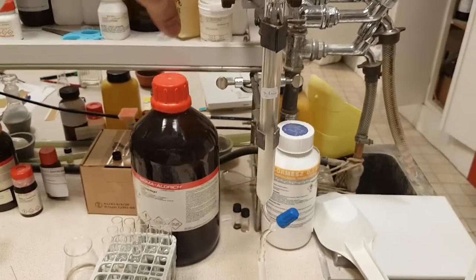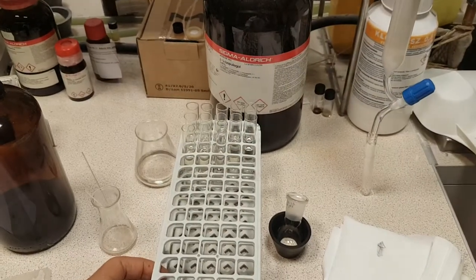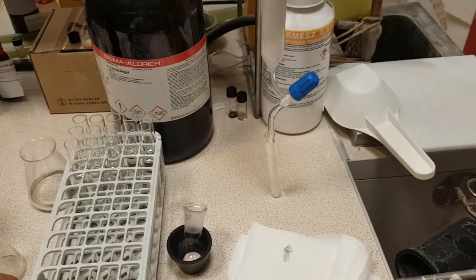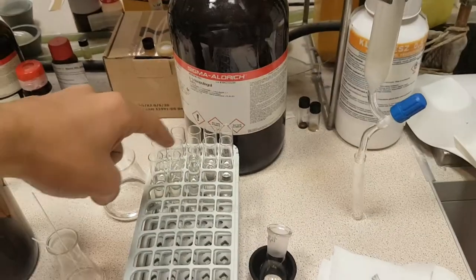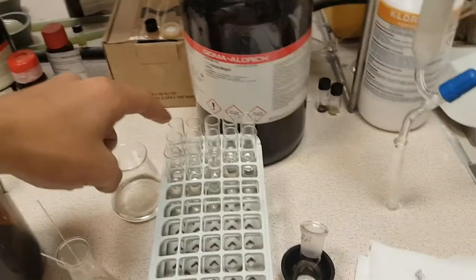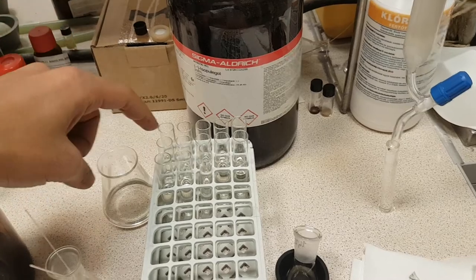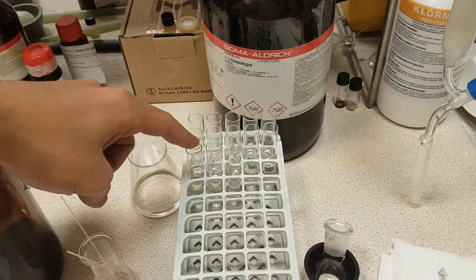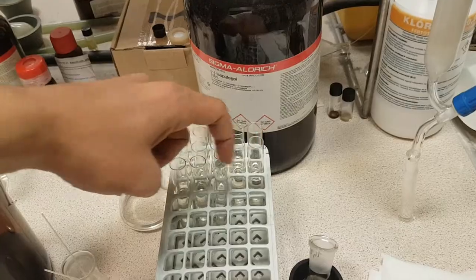This is the column chromatography. You need to prepare a rack of tubes, and you need to change tubes each time. You prepare many tubes and label them 1, 2, 3, 4, 5, 6. Afterwards you have to spot every tube, for example, to see which fraction contains your compound.